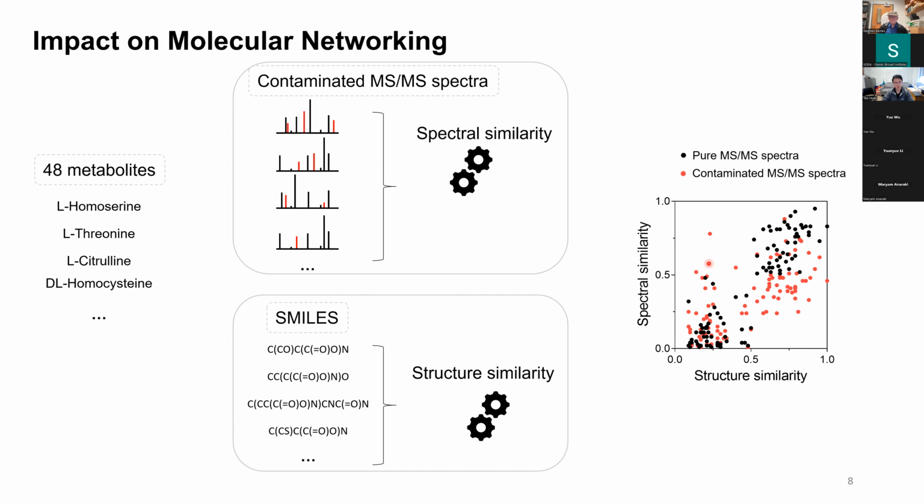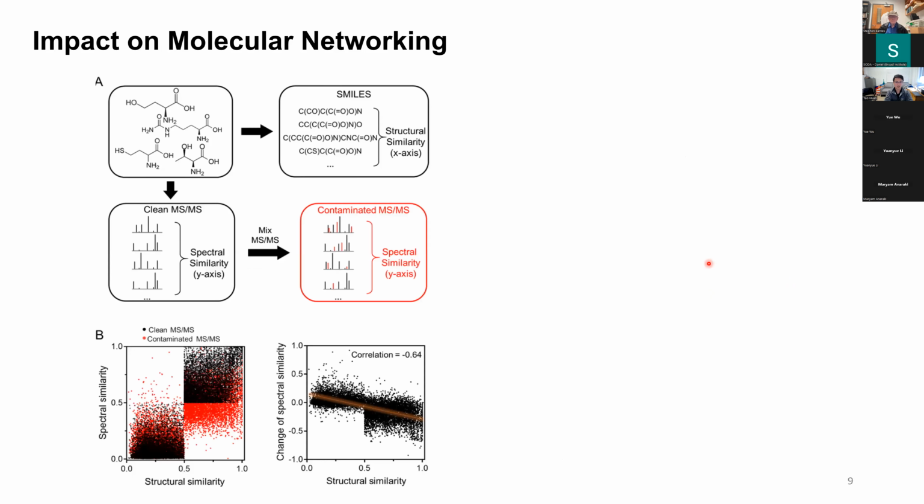And then we also repeat this process using the NIST-20 spectral database with tens of thousands of high-quality MS/MS spectra.